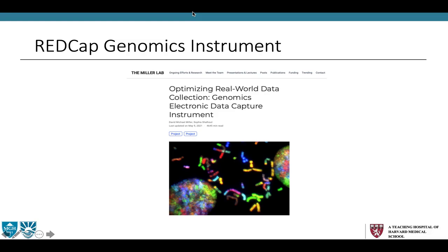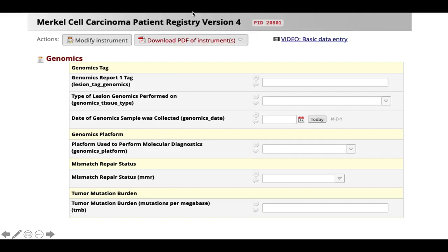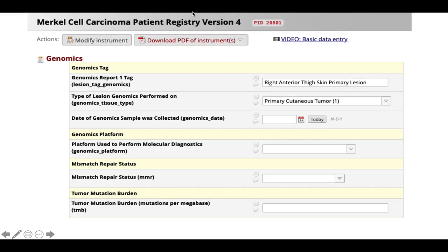The post is titled 'Genomics Electronic Data Capture Instrument' under our 'Optimizing Real-World Data Collection' series. This instrument was designed to capture relevant clinical metadata and the sequencing and genomics results. In the first field, for example, you can place a string to describe the tissue that was biopsied and sent off for sequencing — we call it a lesion tag. In this example, we performed next-generation sequencing on a right anterior thigh skin primary Merkel cell. The metadata is obviously very important, as some of our patients have 20 lesions and we send off primary and metastatic lesions for sequencing, as well as blood samples for liquid biopsies.